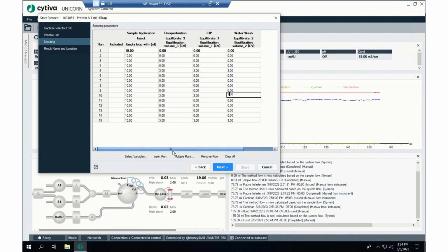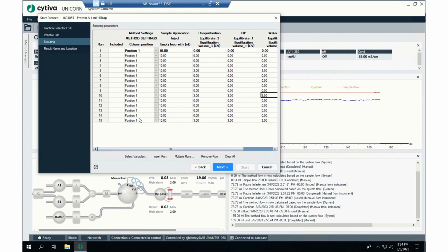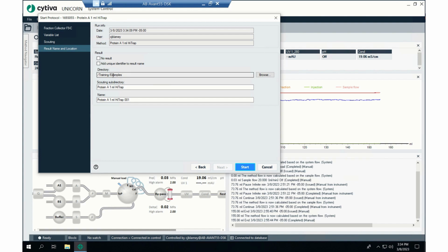Okay, so this moved over. There we go. All right, that's scouting. That's 15 runs, right? And now the result name and location. I'm going to hit next. There's one thing that's a little different about this step: this line, the scouting folder subdirectory, is now open. This is what the actual name of the result will be, but UNICORN is going to group all of these together, and that's what the subdirectory is. So we're going to call this grouping 150 milligram purification. Then we're going to save this in the training examples folder, like where everything else has been going for my videos.